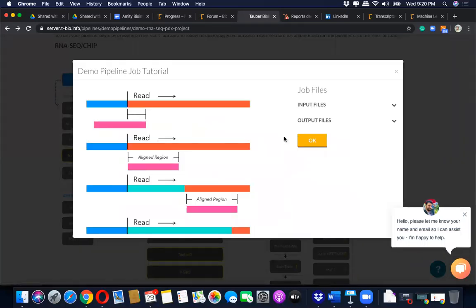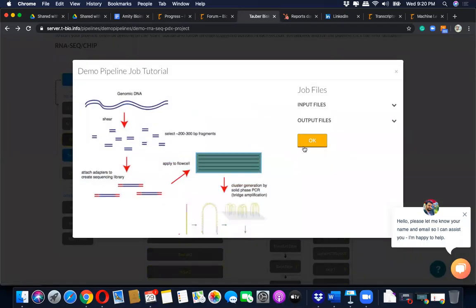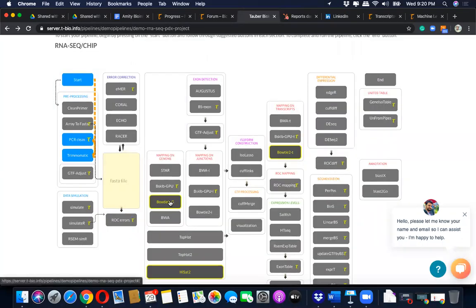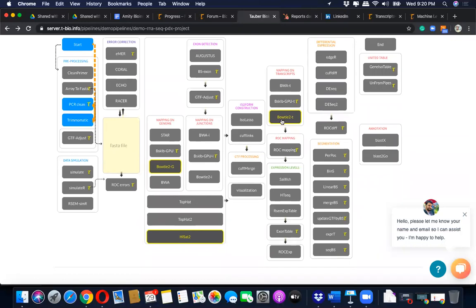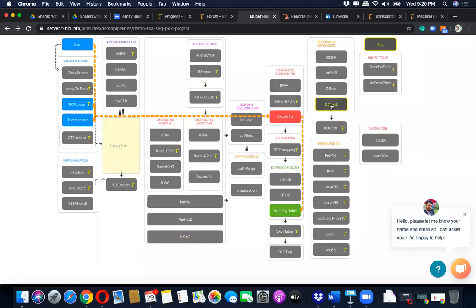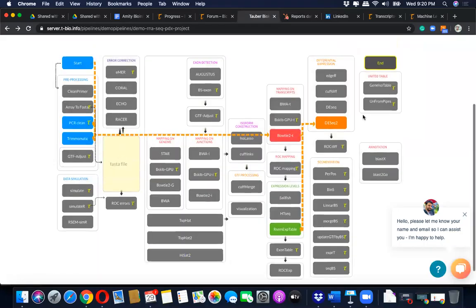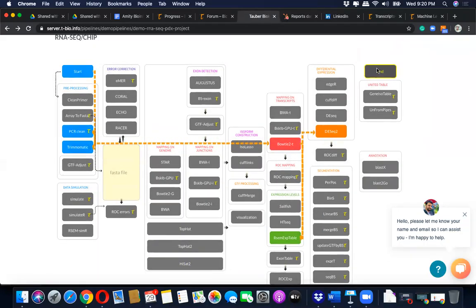We will again do the same steps, and this time we will select differentially expressed genes. And then we did a table of expression. Once we get a table of expression, DESeq2 itself does some sort of normalization, log transformation, and then the analysis.